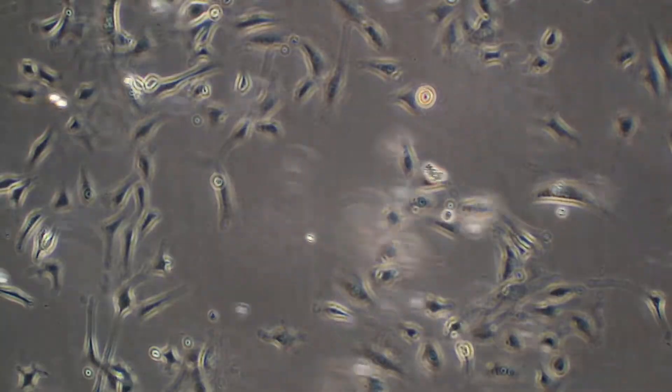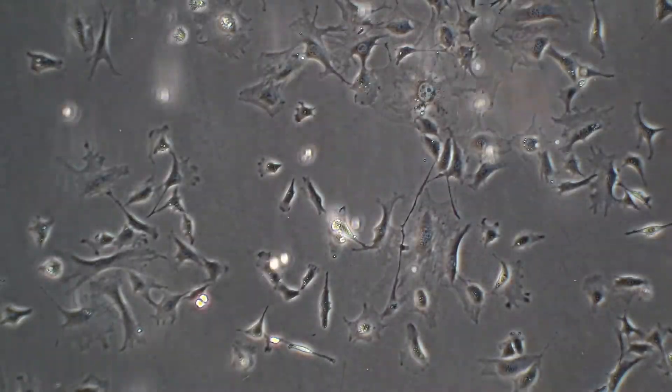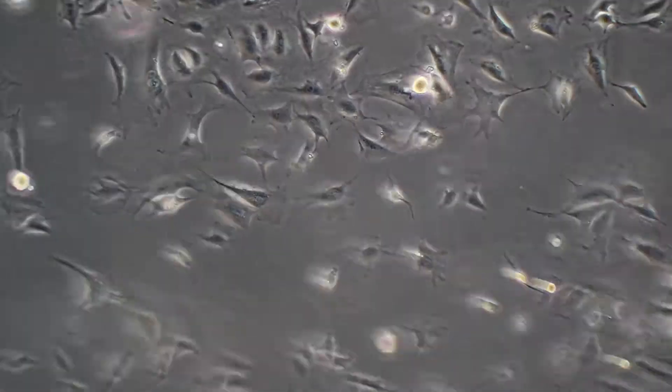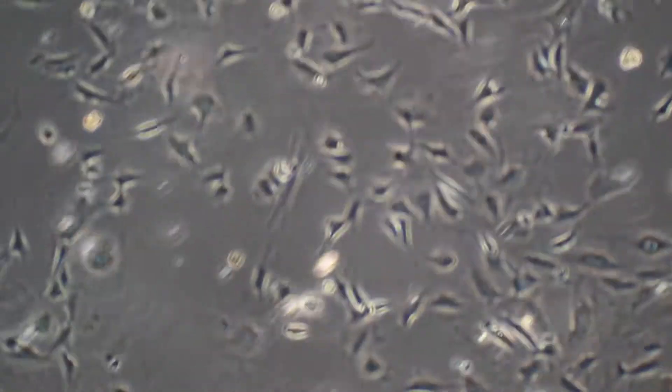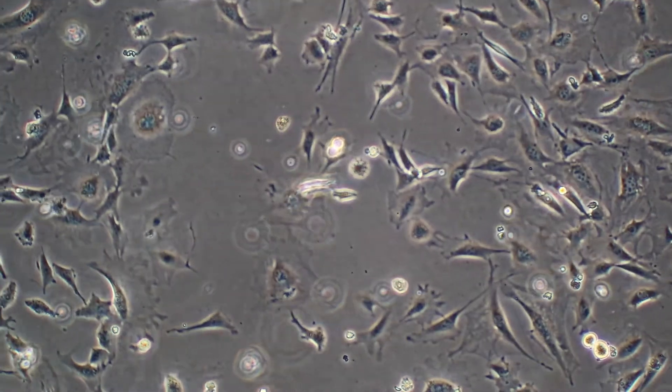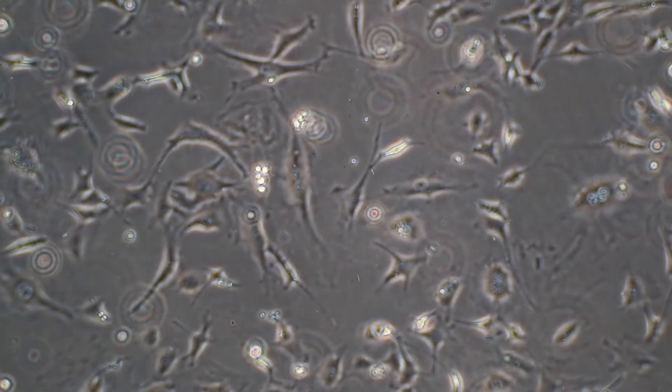So those were the cells that were not centrifuged, and now we have the cells that are centrifuged. So again, these cells look very good. You see there's some floaters. It actually looks very similar to the other flask to me. So typically I don't end up centrifuging my cells much at all because you can tell I don't think it really mattered. There's a little bit of a bare patch, but I think we're in pretty good shape as far as cells. And these are what typical fibroblasts will look like. You can see they're a little bit more dense as we get to the neck, and that may just be because I didn't do a good job mixing and they settled more in the neck area of the flask. But again, these are very typical fibroblasts. You see different morphologies. Some are very spindle-like morphology. Some are really spread out, more thin and narrow. But otherwise they look very good. Our cells look good, so I'm just going to feed these.